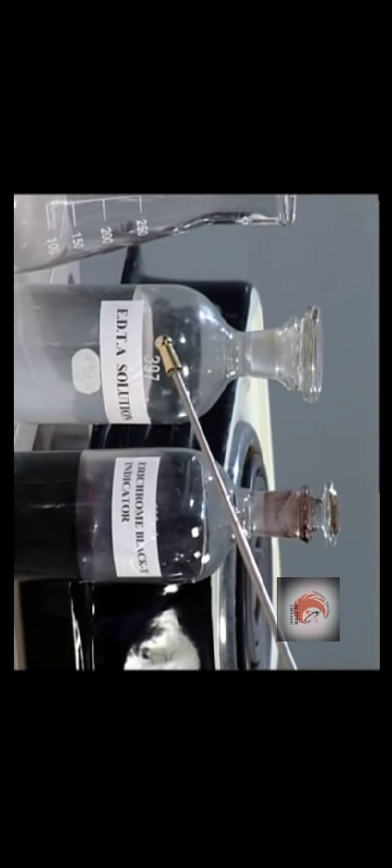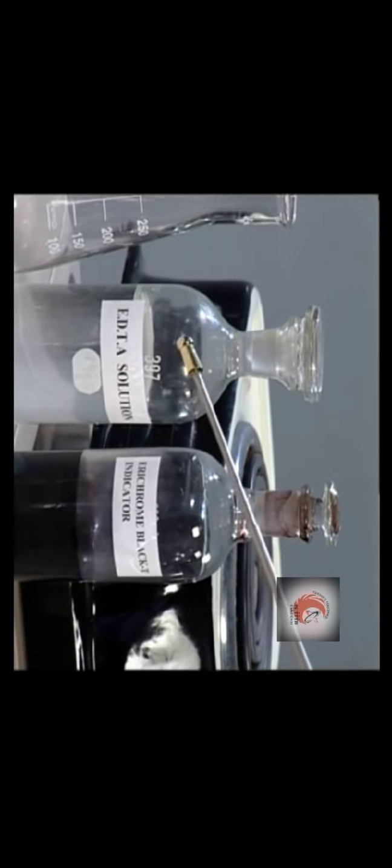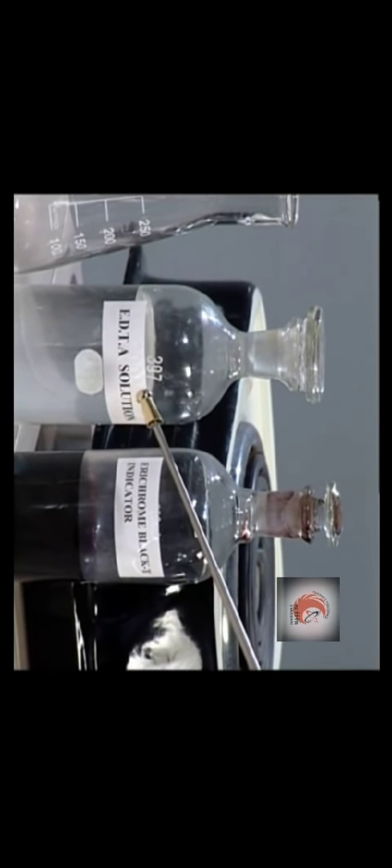Now first we have to prepare reagents of desired concentration. The EDTA standard solution is prepared by dissolving 4 gram of sodium salt of EDTA and 0.1 gram of magnesium chloride in 800 ml of water.